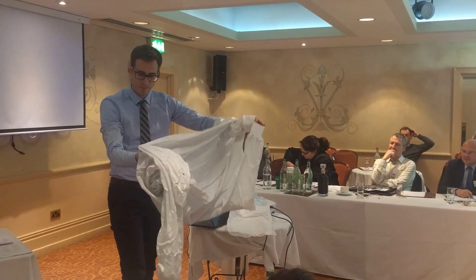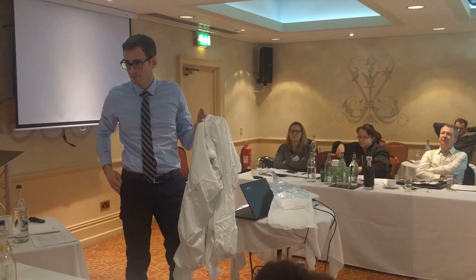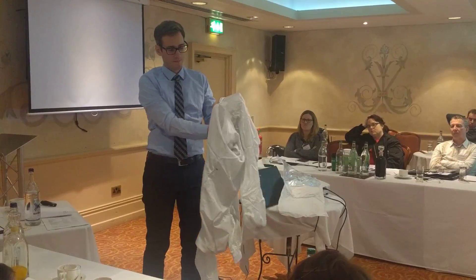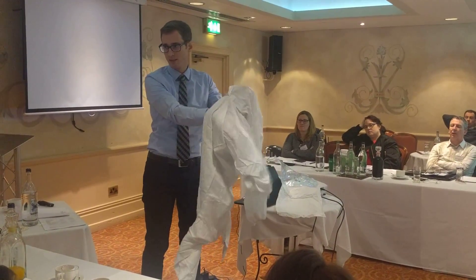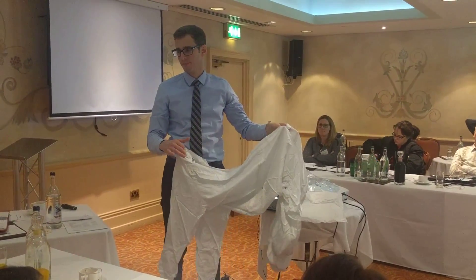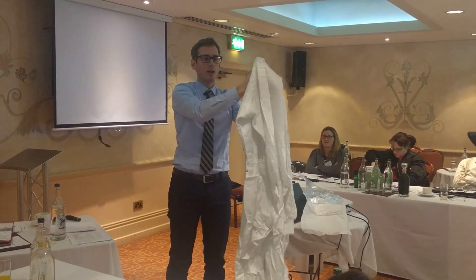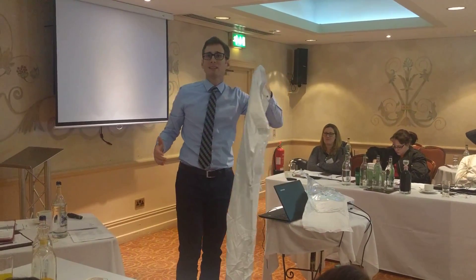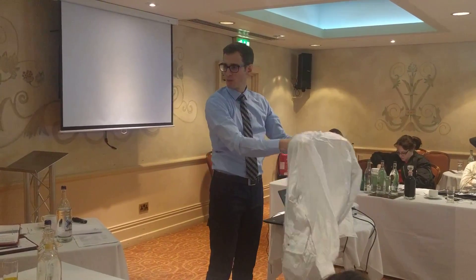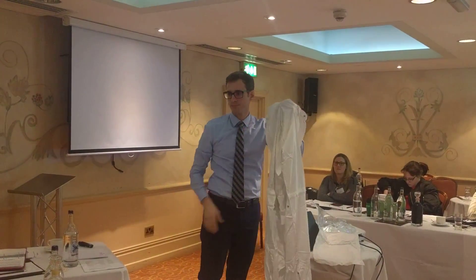If we're going to reuse the same suit, do we need to hang it or put it in a basket in a certain manner? Mostly it's hung on a hook or a bar. But even there, it's an advantage if the bar is fixed, because otherwise you take it from there, fix it elsewhere, and you wipe the floor. If the bar is fixed, you can just put it there directly.